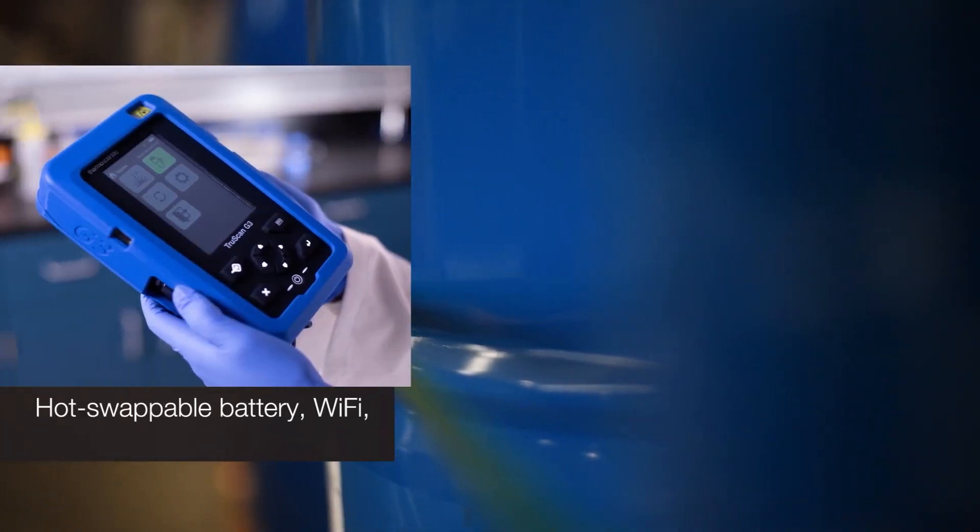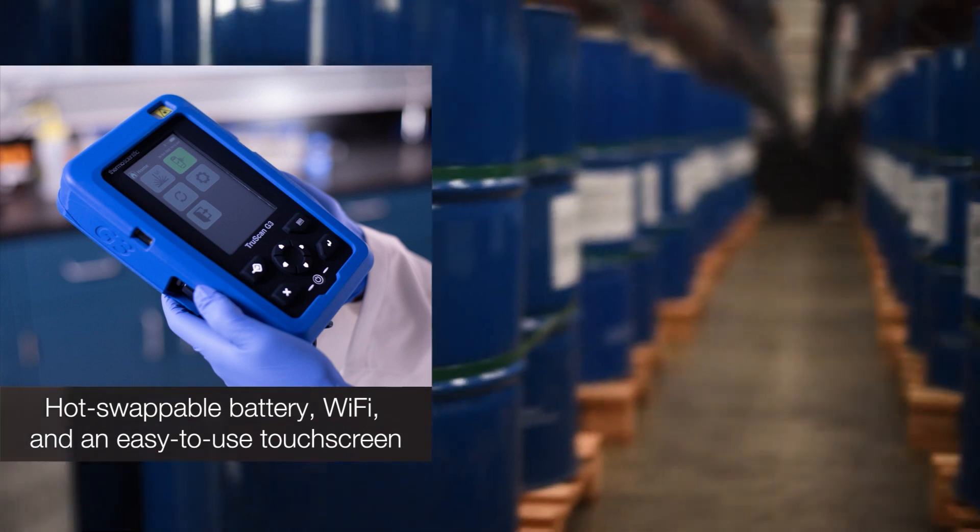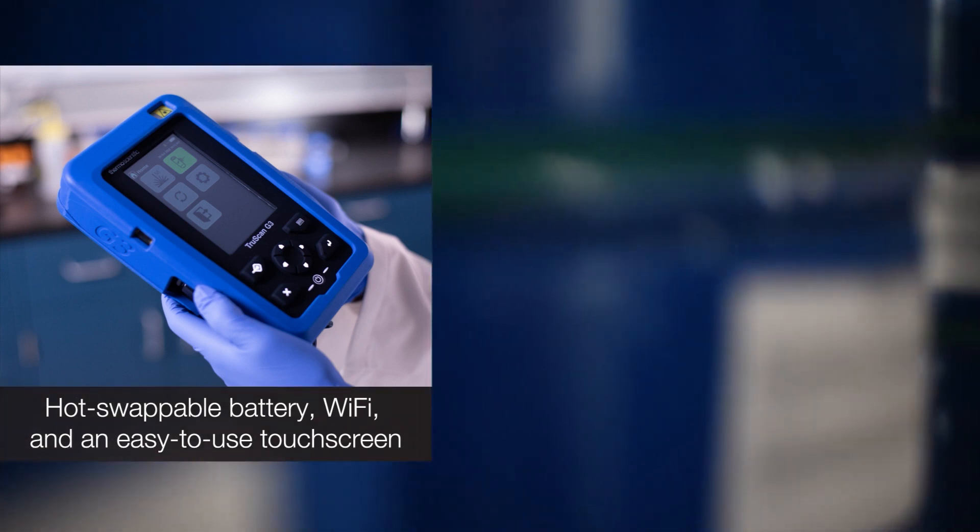The TruScan G3 handheld Raman analyzer offers new features like a hot swappable battery, Wi-Fi, and an easy-to-use touchscreen, even with gloves.